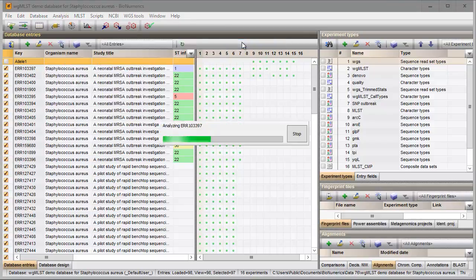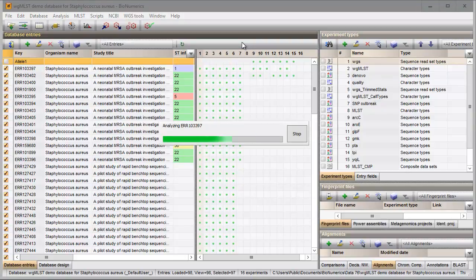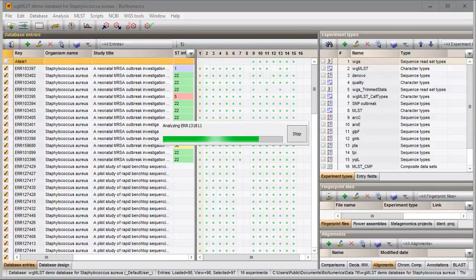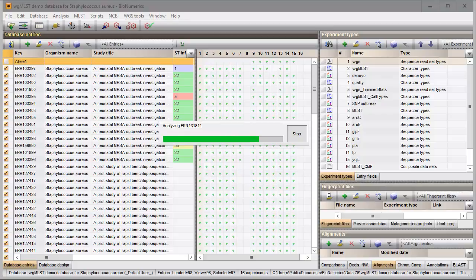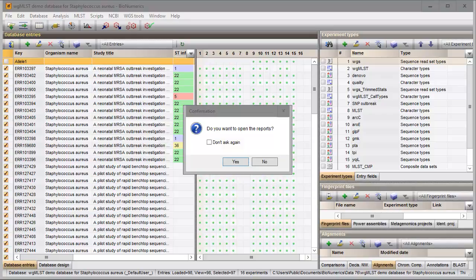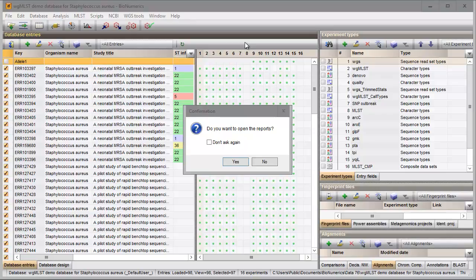A progress bar appears. When the analysis is finished, a dialog is displayed. I select yes to call the report window.